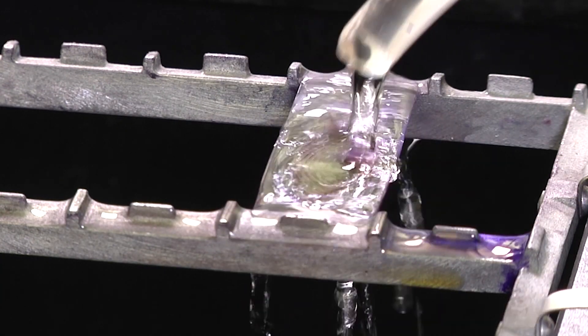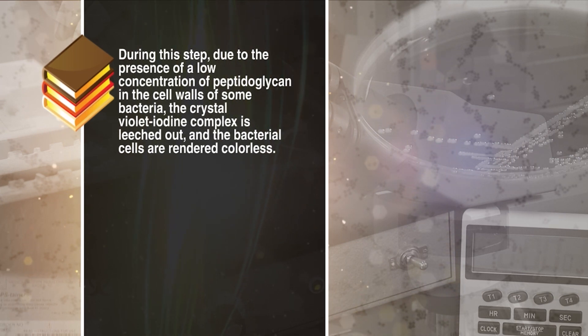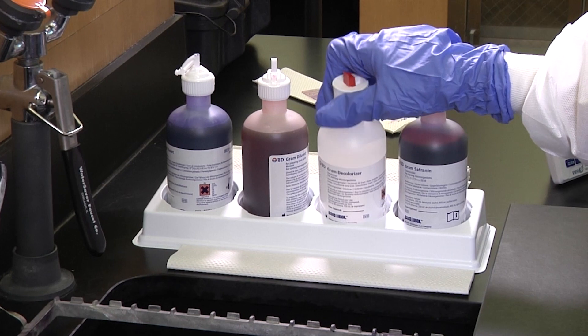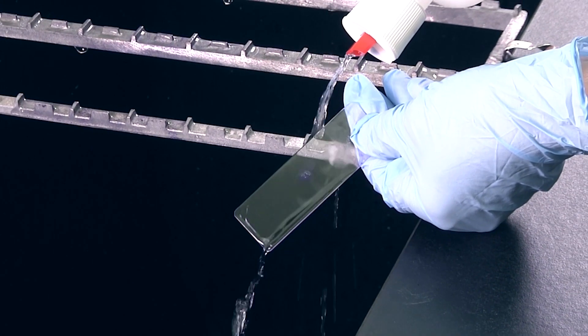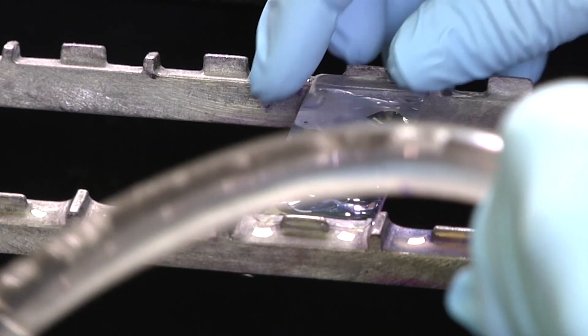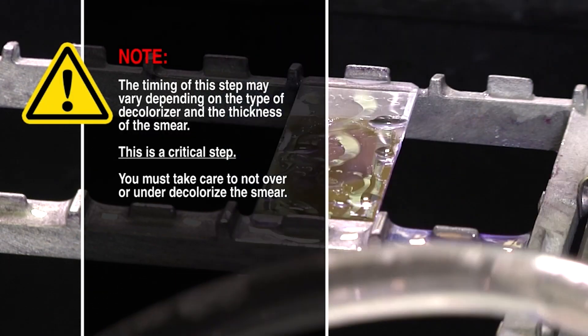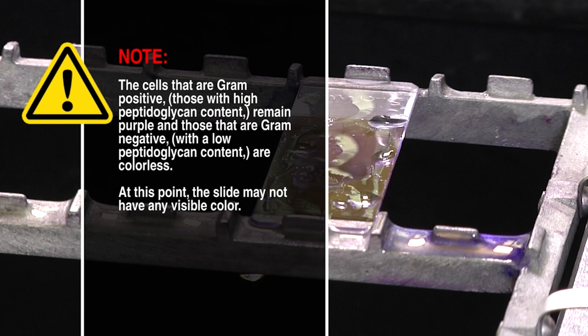The next step in the procedure is adding the decolorizer. There are other types of decolorizers that can be used, so check with your lab's protocol. During this step, due to the presence of a low concentration of peptidoglycan in the cell walls of some bacteria, the crystal violet iodine complex is leached out and the bacterial cells are rendered colorless. Hold the slide at an angle and pour or drip the decolorizer down the slide until the runoff is clear. This may take only a few seconds. Immediately rinse the slide with water to stop decolorization. Please note, the timing of this step may vary depending on the type of decolorizer and the thickness of the smear. This is a critical step — you must take care not to over or under decolorize the smear. Cells that are gram positive, those with high peptidoglycan content, remain purple. And those that are gram negative, with a low peptidoglycan content, are colorless. At this point, the slide may not have any visible color.